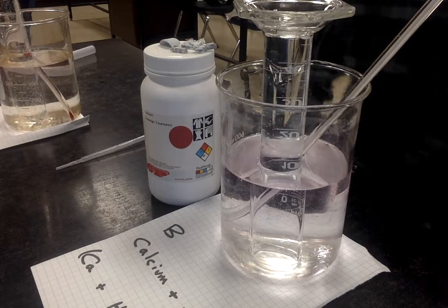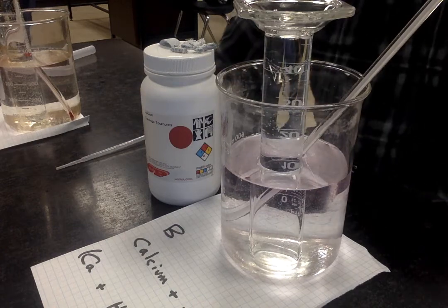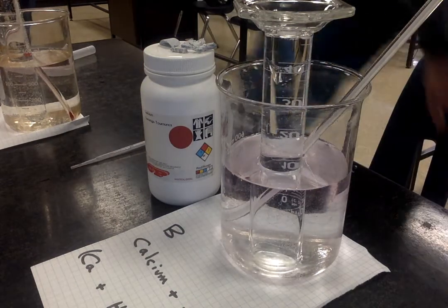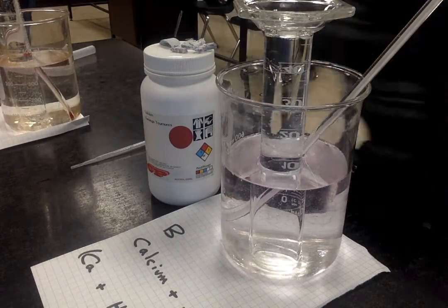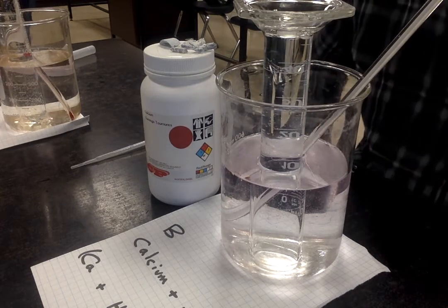You can think about the reason for my doing that as we go along. I'm also going to start up the Bunsen burner.